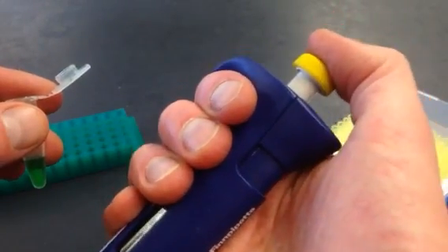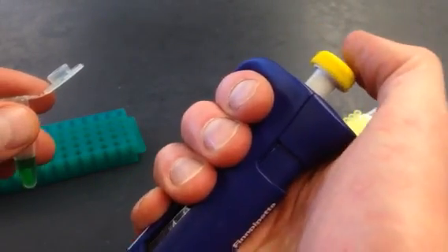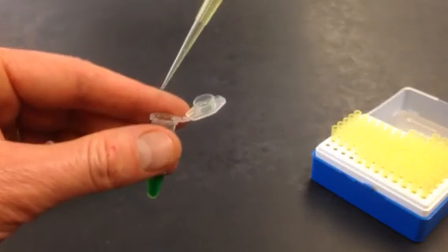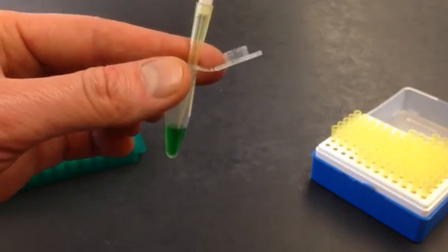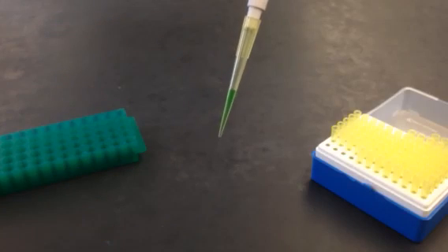To measure accurately, you're always going to push down to that first stopping point and then let it up. So I'm going to push down gently, put the tip in where I can see it, draw that up, and now I have my 40 microliters in there.